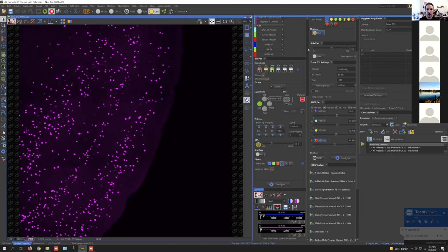The two things that you might want to add to this are, okay, how about I automatically detect the tissue rather than using these manual regions? That's definitely possible. And the other thing is, maybe I want to count the cells at the same time. After I get these images, what I was planning to do is take them back to the computer, and sometime later when I have some time, put them through ImageJ and have a pipeline where I could count those cells. And that's a whole other thing that I need to think about.